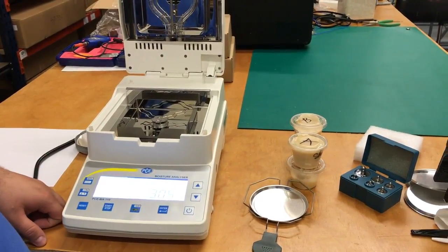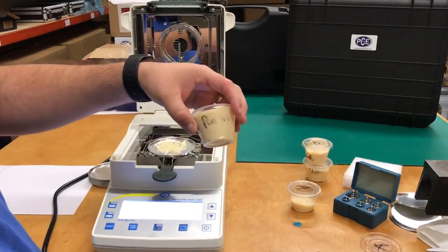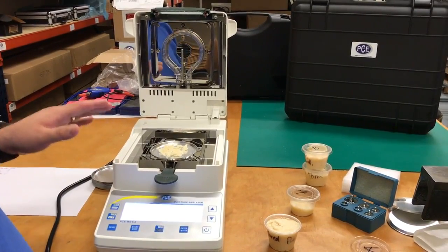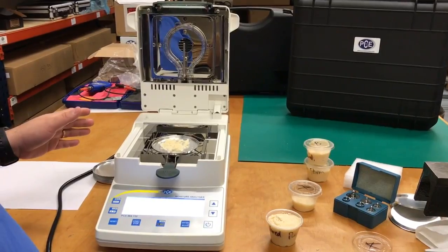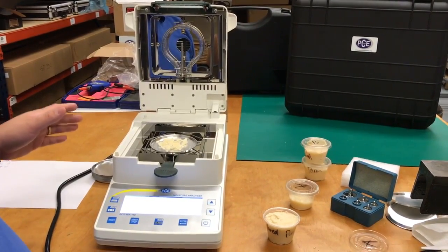Now we are going to be measuring Parmesan cheese, sample A. We're going to be checking how much moisture is on the Parmesan cheese. This scale is already on standard mode and it will go to a high temperature of 120 degrees Celsius.